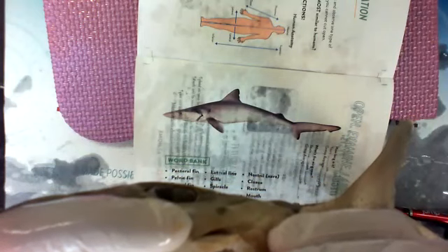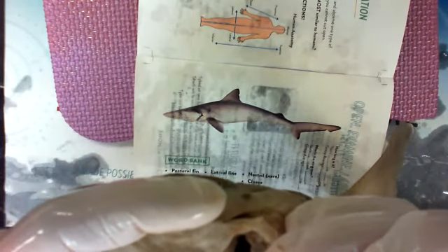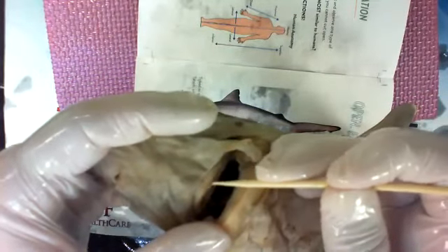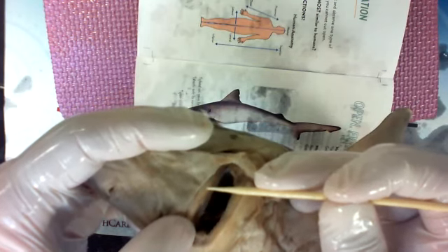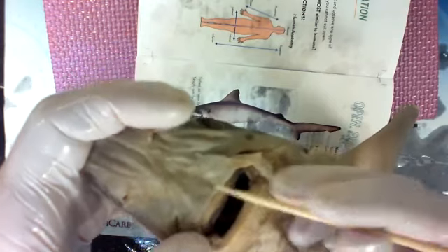Check out those teeth. See how many rows of teeth we have here. We got 1, 2, 3. 3 rows on this guy. So when a shark loses a tooth, it doesn't get cavities. There's one row up here, a middle row, and a back row. It pops the tooth out, swallows the tooth, recycles it for the calcium, and then one of these back teeth will actually move up into that position. So the front row is actually just constantly being recycled from other rows. That's the mouth. Its jaw feels hard, but there's no bone, it's all cartilage. We'll cut it later and show you.